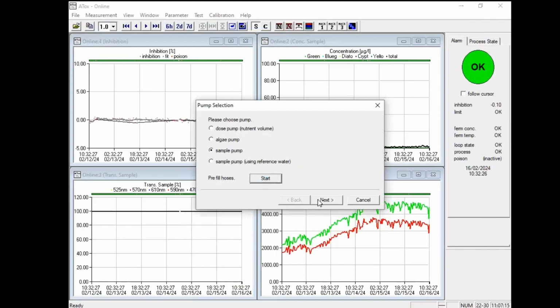Okay, now everything would be with water, and you would have to take a tube which is coming out of the pump, where you pump your volume, and then you would start the calibration, which is here set to 60 seconds. The tube you cut or you take off, you put in a suitable graduated cylinder where you can meter the volume of water, and then you start the calibration.